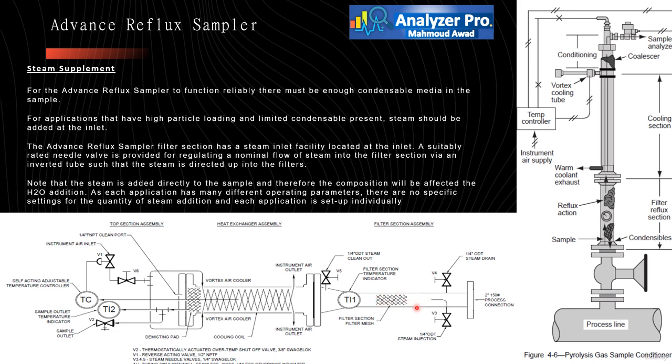Note that the steam is added directly to the sample and therefore the composition will be affected by the H2O addition. As each application has many different operating parameters, there are no specific settings for the quantity of steam addition and each application is set up individually.